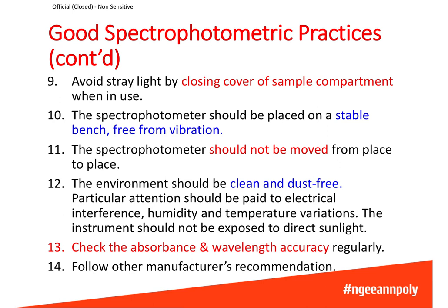Spectrophotometers contain mirrors as well as diffraction gratings, which have to be aligned perfectly in order to direct the path of the light correctly. So to avoid these components from shifting around, the spectrophotometer should be placed on a stable bench, which is free from vibration. And we also try not to move the spectrophotometer from place to place. To avoid any interferences with the absorbance, the environment should be clean and dust-free.